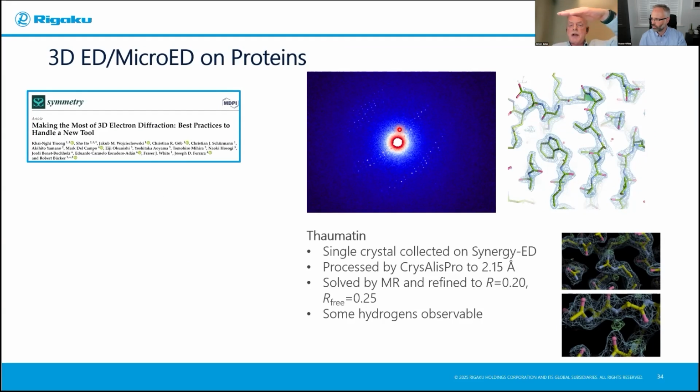So we can just change that in the software. We can pull the detector back, we can bring the detector in, so we can change the effective resolution of the measurement. And this enables us, by pulling the detector back, to pull apart these diffraction peaks quite clearly, to isolate them, and then quite cleanly derive the protein crystal structure, looking for ligands and active sites.